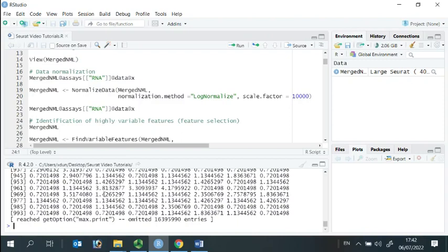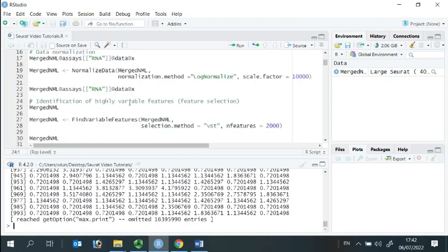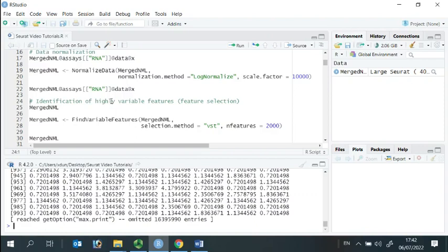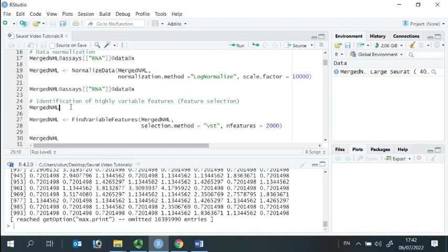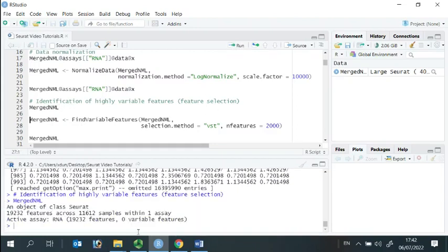Following data normalization, we calculate a set of variable features. They show a high cell-cell variation in our data set. The features will have high expression in some cells, but low expression in other cells.